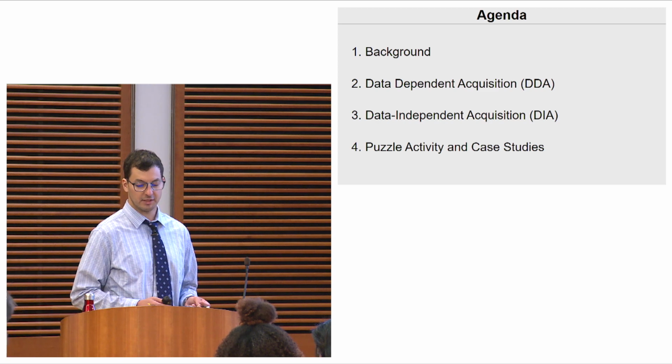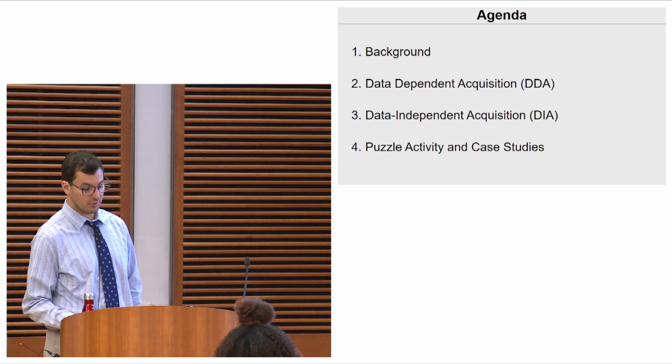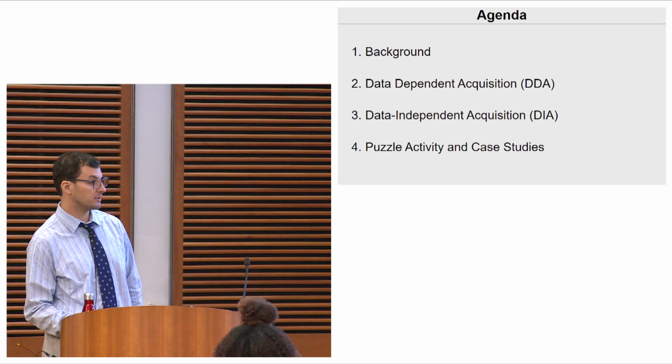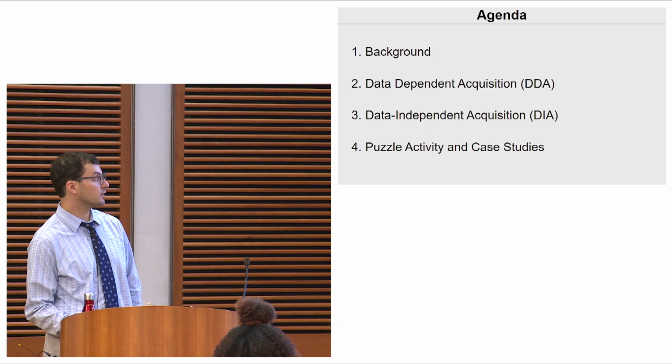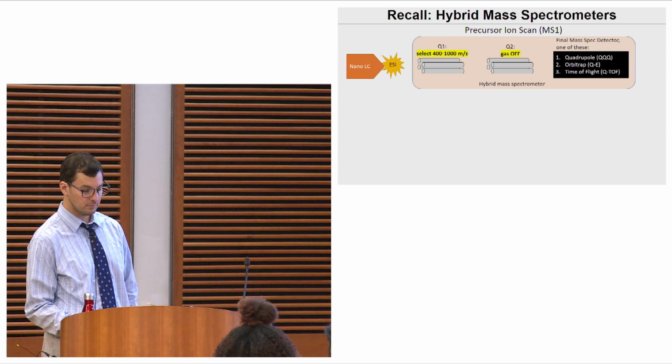To help you understand mass spectrometry as an analytical tool for your research and to achieve those learning objectives on the last slide, we'll cover these four points over the next hour or so. First, we'll start with some background. Then I'll go in detail through data-dependent acquisition. Next, we'll cover data-independent acquisition. And then finally, we'll do a fun activity that I hope reinforces these concepts, and we'll look at some case studies that attempt to compare these methods.